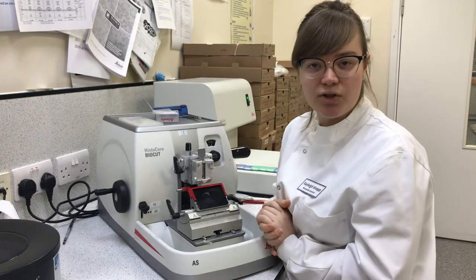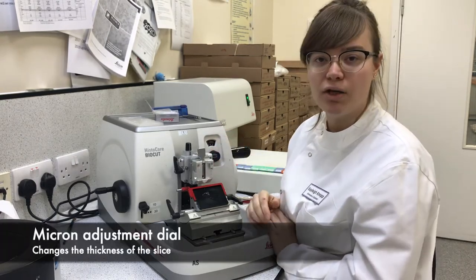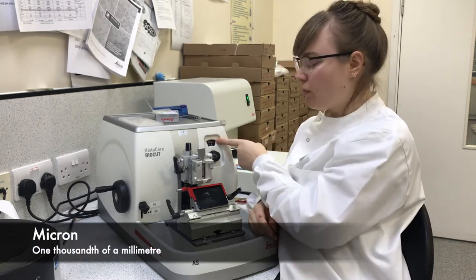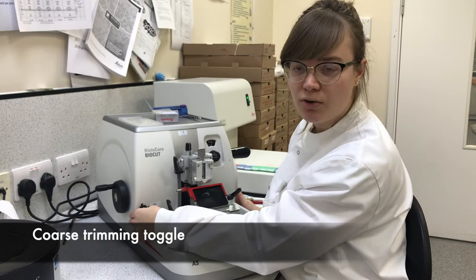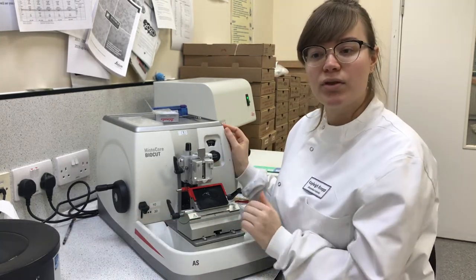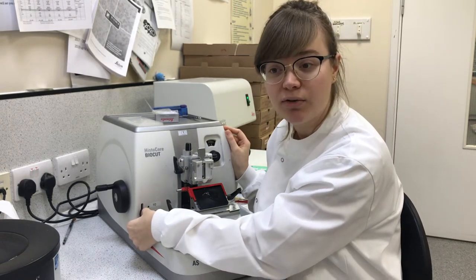To change how much the block advances, you'll use this — this is your micron adjustment. Each one of these lines pertains to roughly a micron thick, so as you turn it up the thickness will increase. This is your coarse trimming toggle. Different microtomes will have different levels — on this one, one click is 10 microns and two clicks is 30 microns.